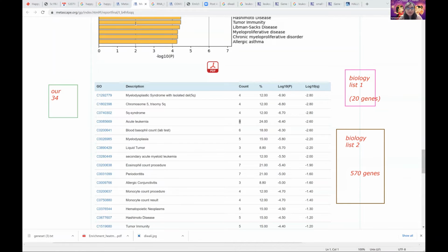So even if you have more overlap between this list and this list, there are so many more genes that you're still likelier to get more overlap between these two. But what if 5 of these genes are found here? That's what statistics tests for: is it really significant?